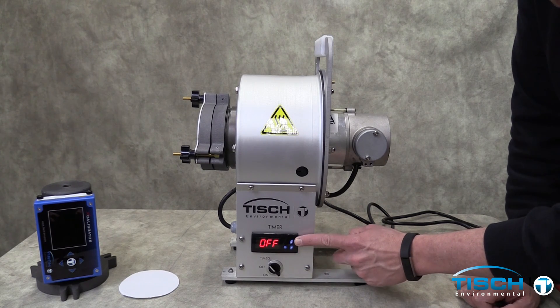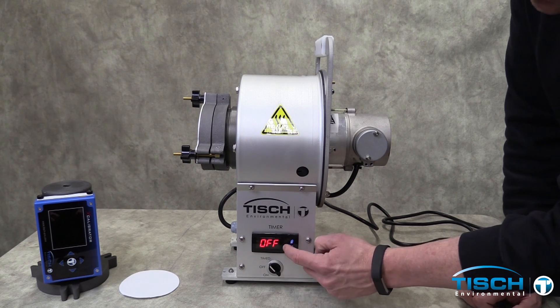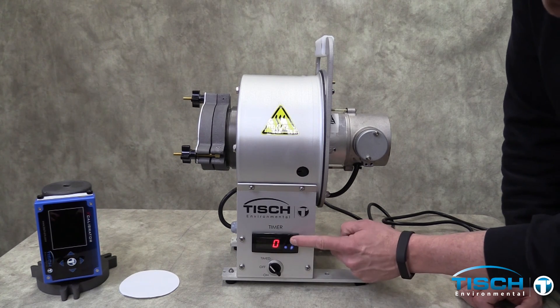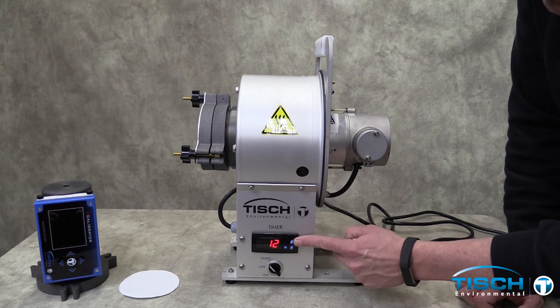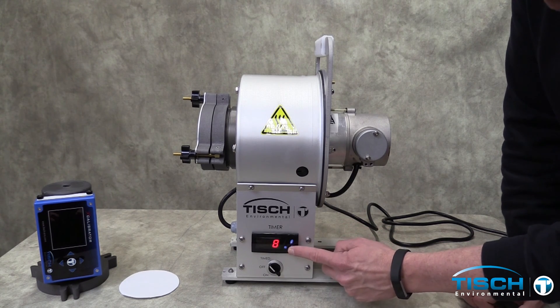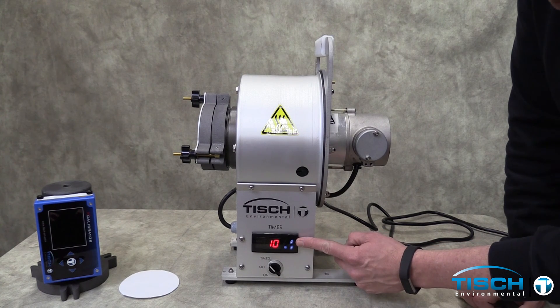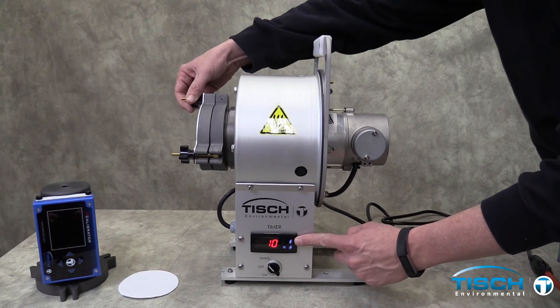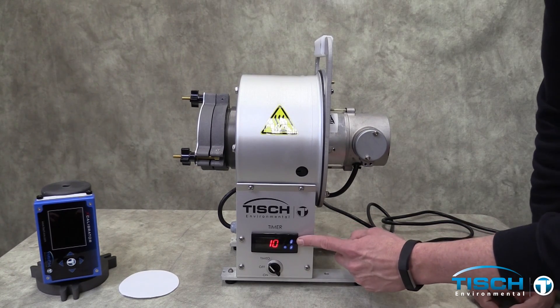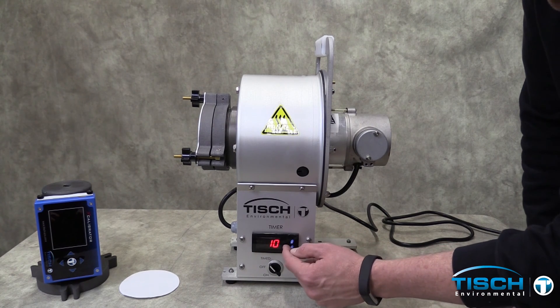You can adjust the time using the arrow buttons. First, press the Set button, then press the up arrow to increase the time and the down arrow to decrease the time. After selecting the desired time, press the Set button to run the sample for the set time.